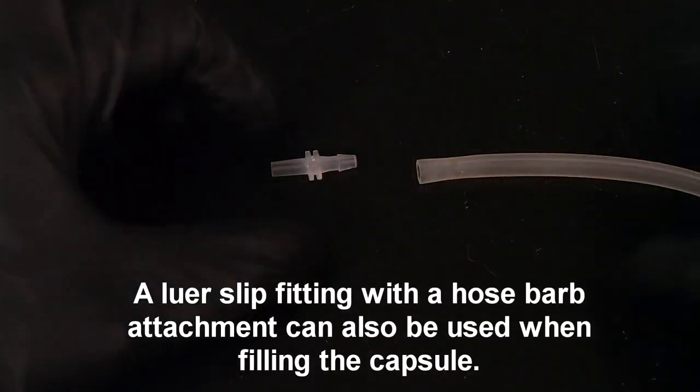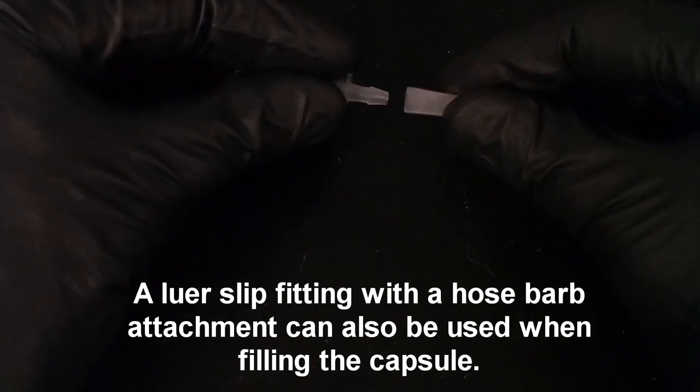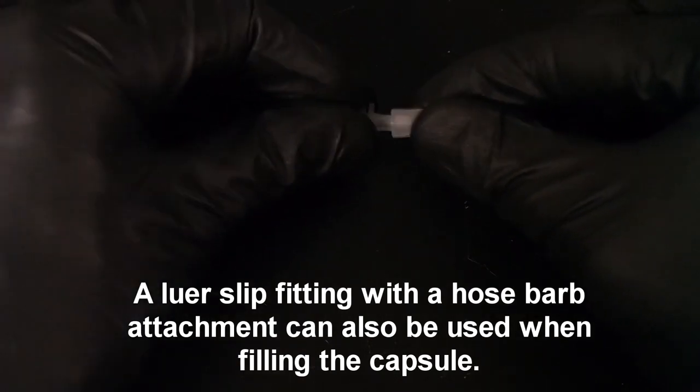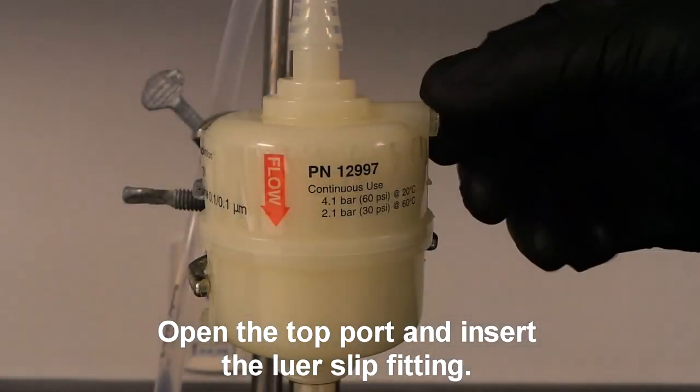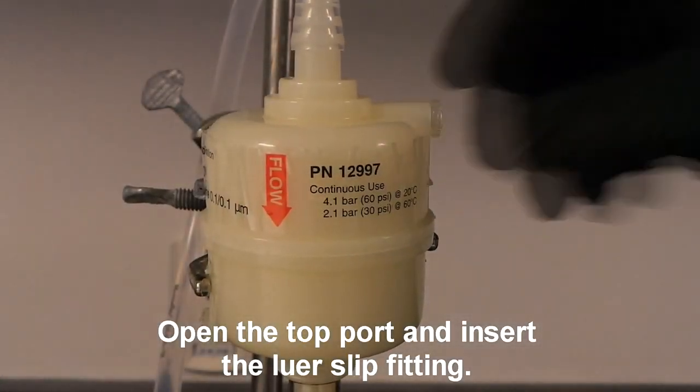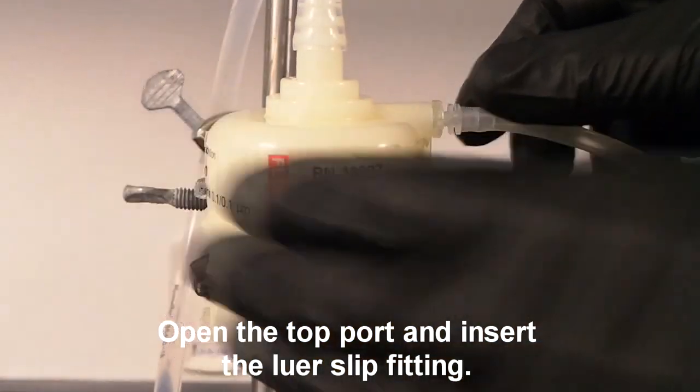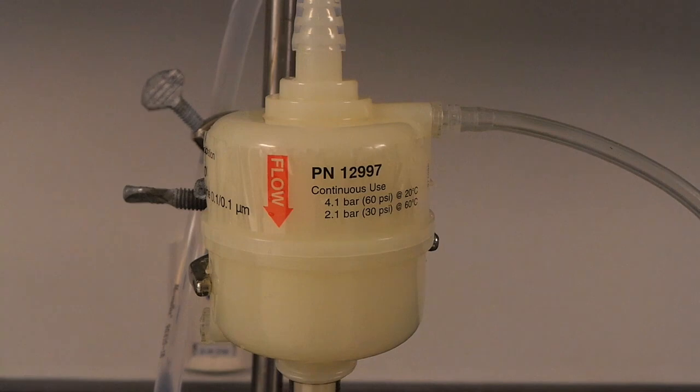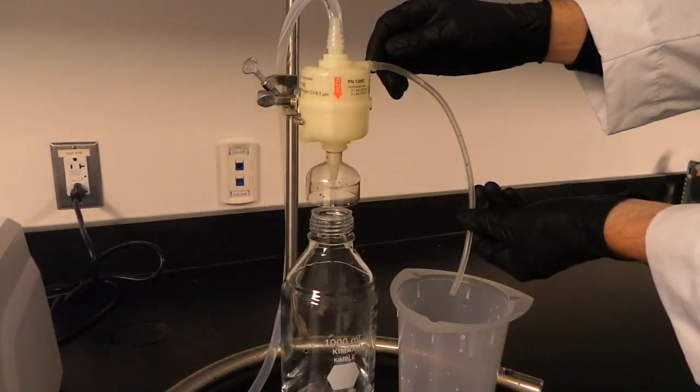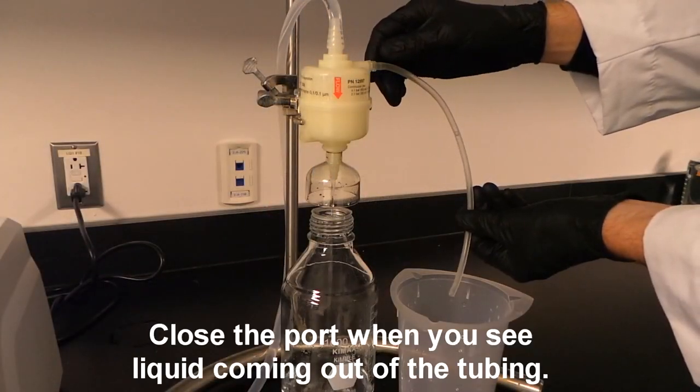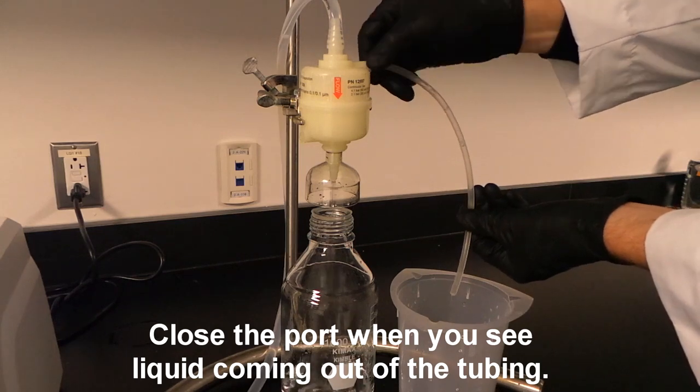A luer slip fitting with a hose barb attachment can also be used when filling the capsule. Open the top port and insert the luer slip fitting, and close the port when you see liquid coming out of the tubing.